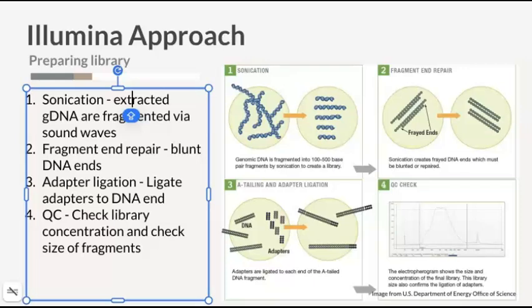Before we get to this step, we had done our experiment, right? You collected your samples, you took the cells and opened them up, and you extract the RNA or DNA; we're going to assume DNA. We extract our genomic DNA, and in order to start preparing your library, you have to take that genomic DNA and fragment it. So that's step one.